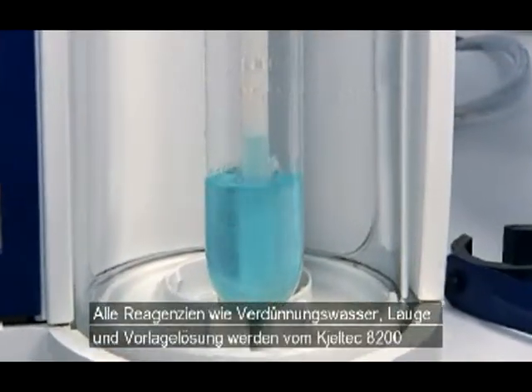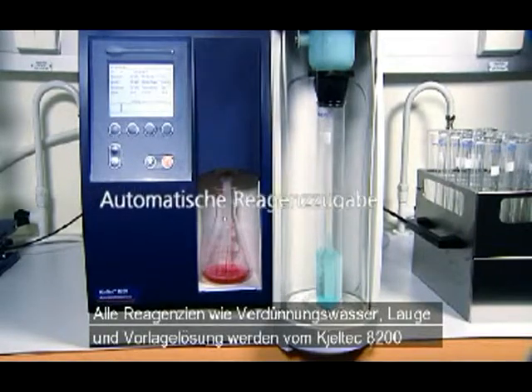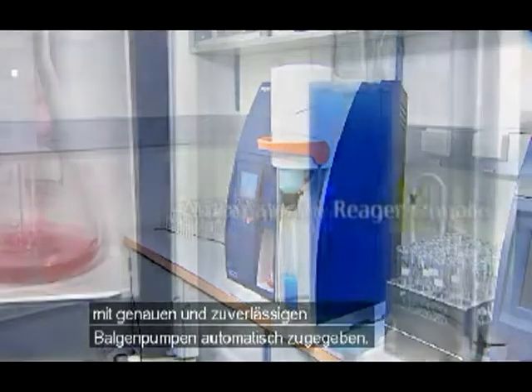The Kjeltec 8200 automatically dispenses all reagents such as dilution water, alkali, and receiver solution using accurate and reliable bellows pumps.